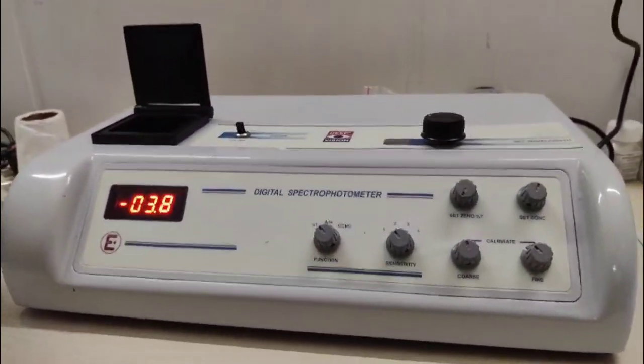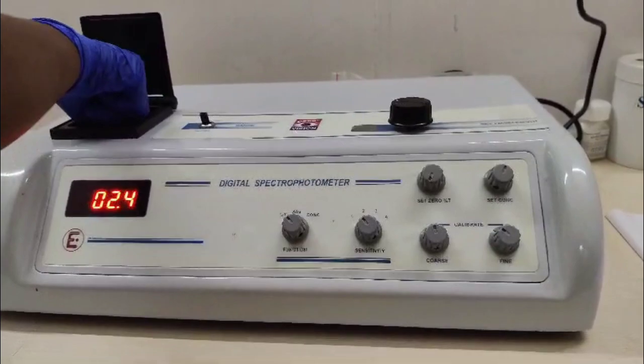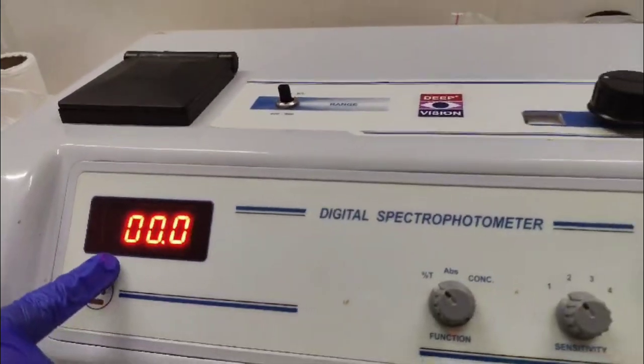Next, set the blank 0.0. Fill the cuvette with unknown solution.